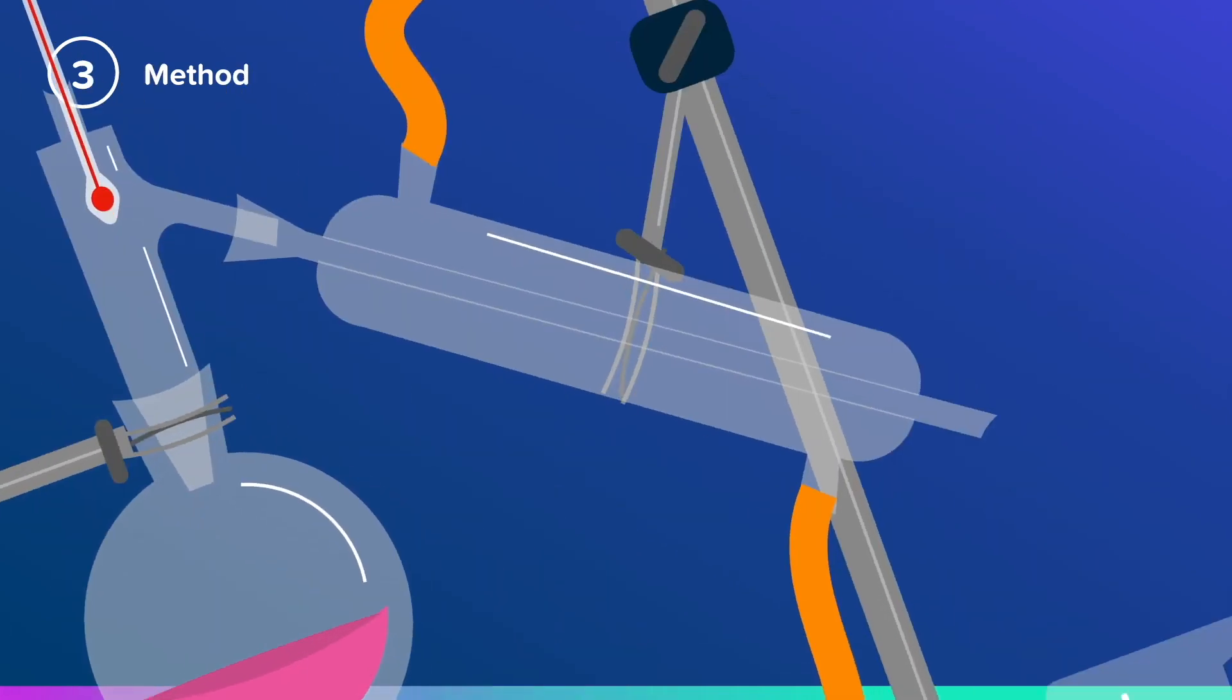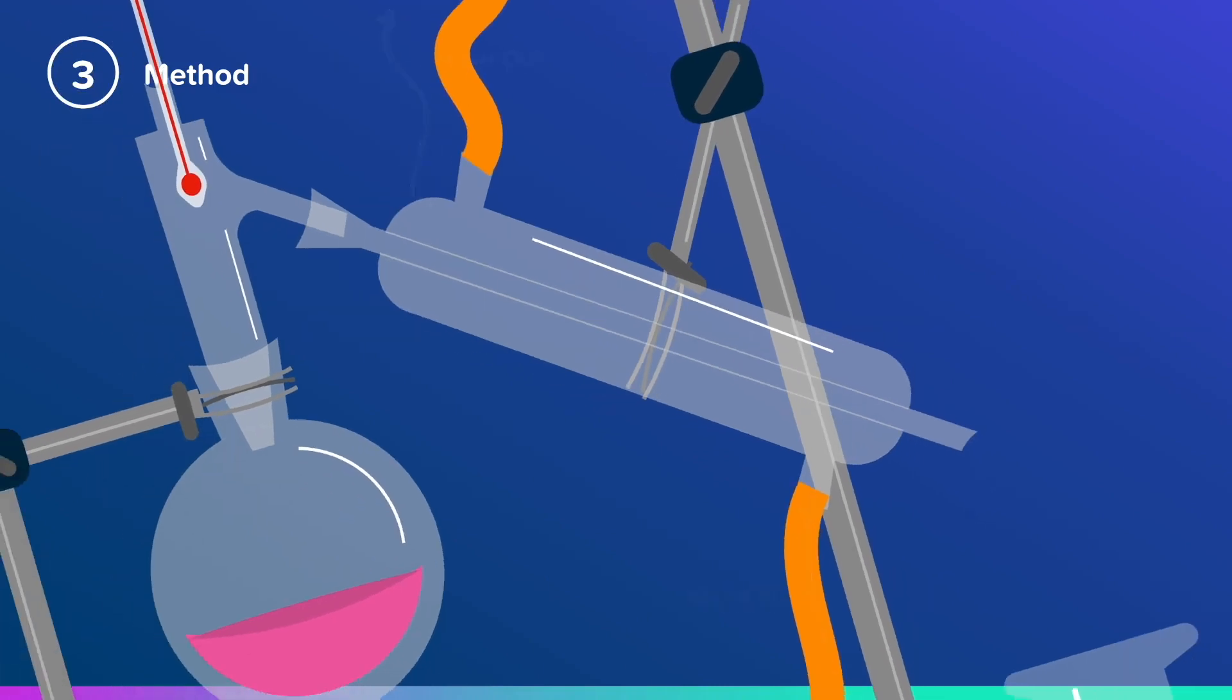Let's look at the condenser in a little bit more detail. Make sure that water is flowing in at the bottom and coming out at the top.